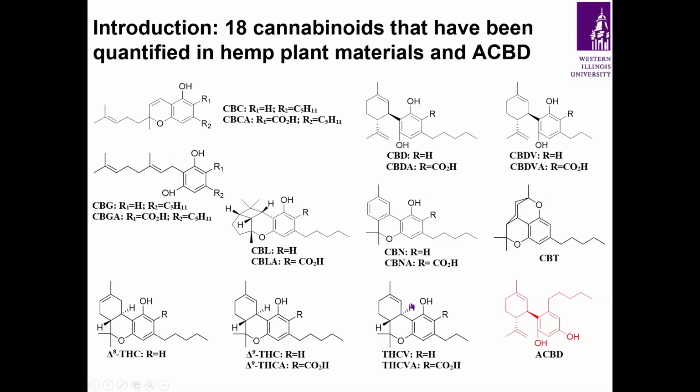In our study, ACBD was used as the internal standard because ACBD, or abnormal CBD, is not naturally present in the cannabis plant.